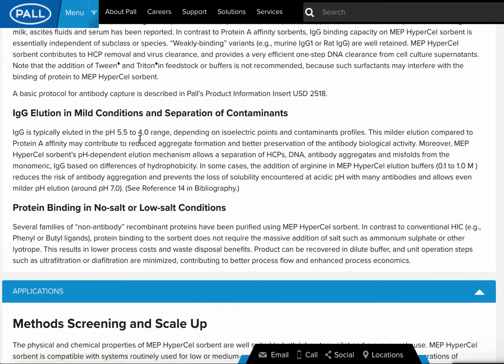It doesn't illustrate the pH of the elution for some reason. I'll ask somebody tomorrow why it doesn't have the elution pH. Maybe they eliminated it from this file for other reasons, and it's not a critical parameter as far as I'm concerned.